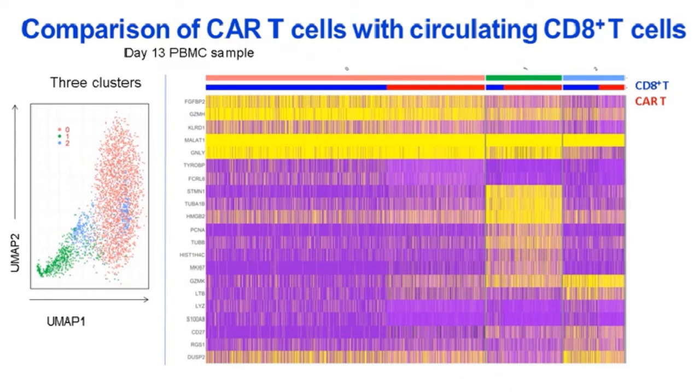So this is a very powerful technology to identify, to an unprecedented level, subsets of T cells that are evolving during therapy, and also to ask the question of how those engineered CAR T cells are differing from the normal T cells of that patient, and what could be the interactions between them. So this is a very significantly advanced technology. We are still analyzing this data.